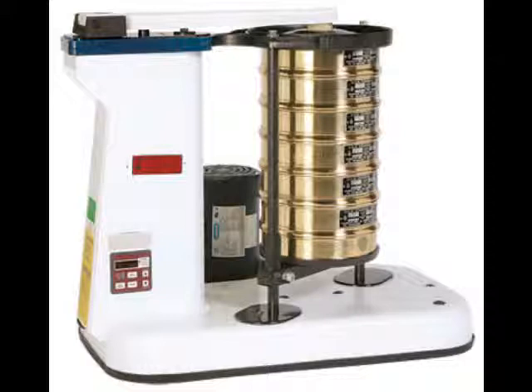And what a sieve analysis is, we use calibrated sieves, which are screens at a certain size, and then you put a pan on the bottom and you shake them in a sieve shaker like this one that I'm showing right now on the screen. You shake that for 10 minutes and then you figure out where did the sand fall out and what is the sand size.